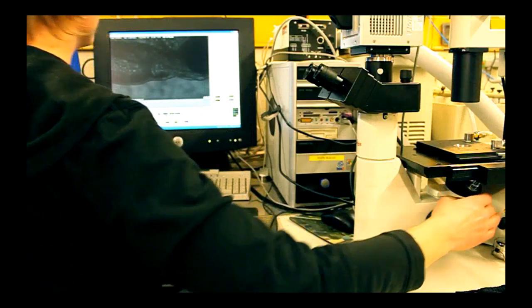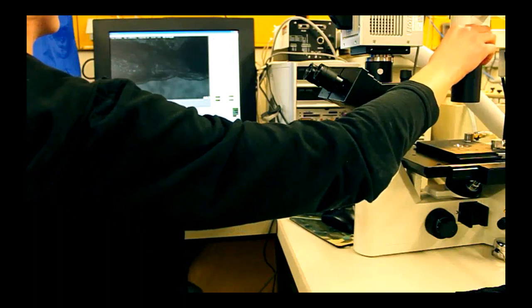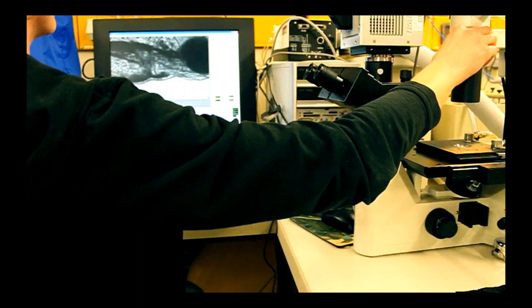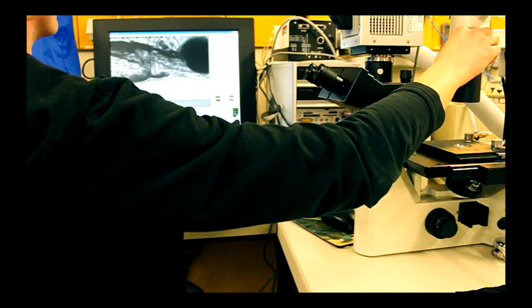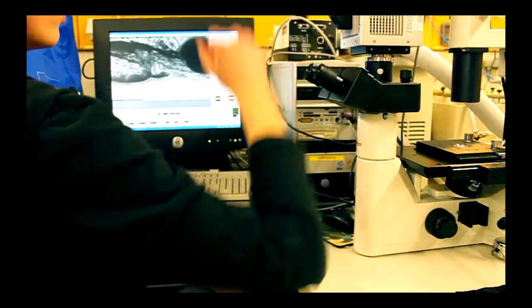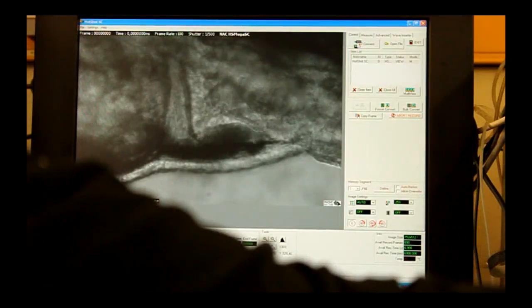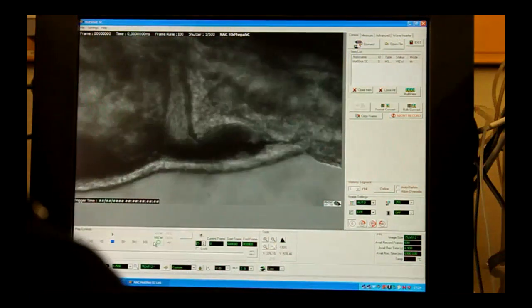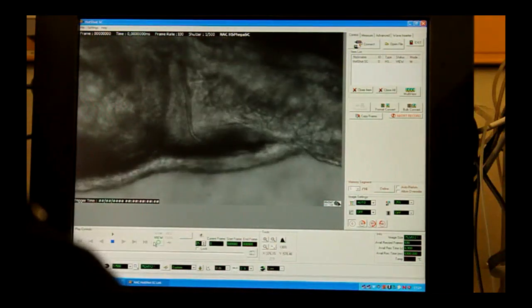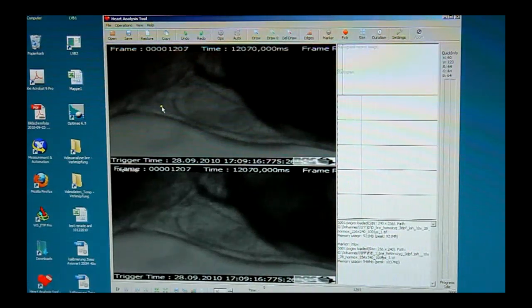We then focused on the heart region and recorded cardiac activity for 4 minutes. For a digital analysis of heart rate and HRV, video footage was imported into a custom-made computer program and tagged with a line marker across the ventricle wall.